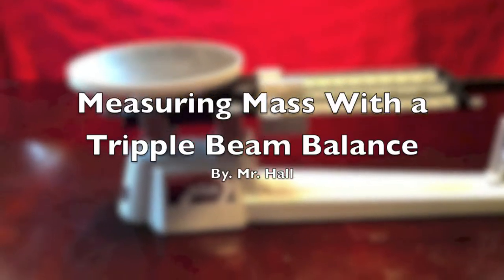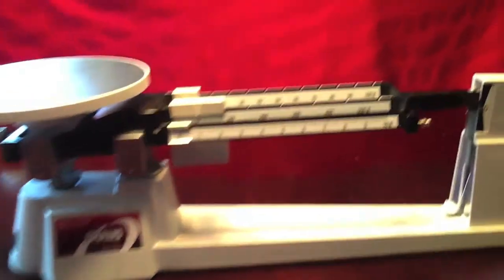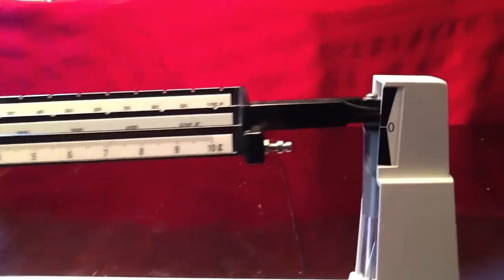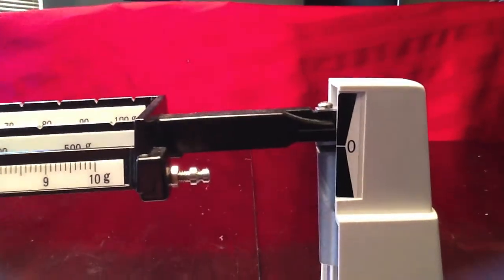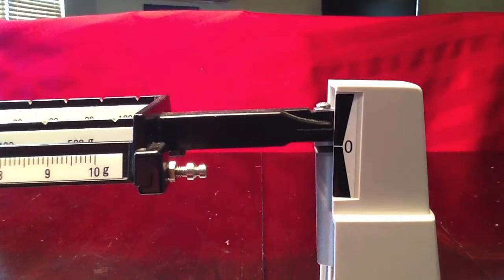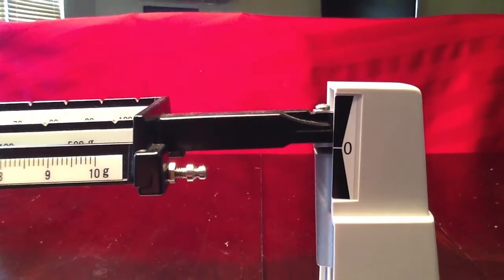We want to make sure that our balance is zeroed. If we look closely, we can currently see that our balance is not zeroed.